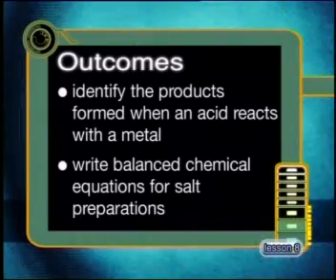By the end of this lesson, you will be able to identify the products formed when an acid reacts with a metal and write balanced equations for salt preparations. Let's go to the lab to see how zinc reacts with sulfuric acid.